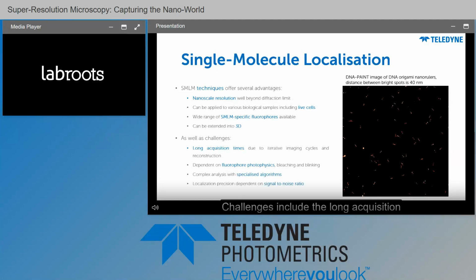Challenges include the long acquisition times because you have iterative imaging cycles and reconstruction processes. You're quite dependent on fluorophore photophysics, such as how the molecules blink and how they bleach. You have complex analysis with specialized algorithms.